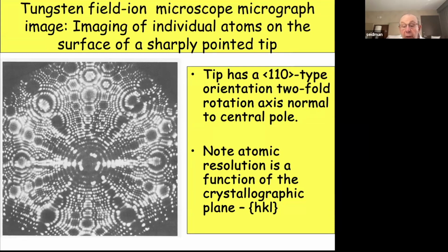And if you look at some of the planes here, you can see individual atoms. I don't know if my cursor works for you, but down here there is a plane and you see atoms on one plane here, and then there's a plane below it. And one of the capabilities of the atom probe is that you can dissect the tip one atom at a time, essentially, but at a very high rate, and then reconstruct it in 3 dimensions.